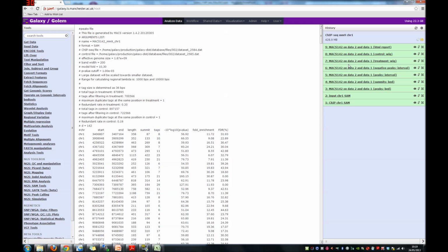They can also be uploaded onto a genome browser. However, you need to do some extra work on these files to do that, and you need to be able to host them from a web server. However, if you run jobs through the Bioinformatics Core facility, these will be hosted for you as part of the data analysis.